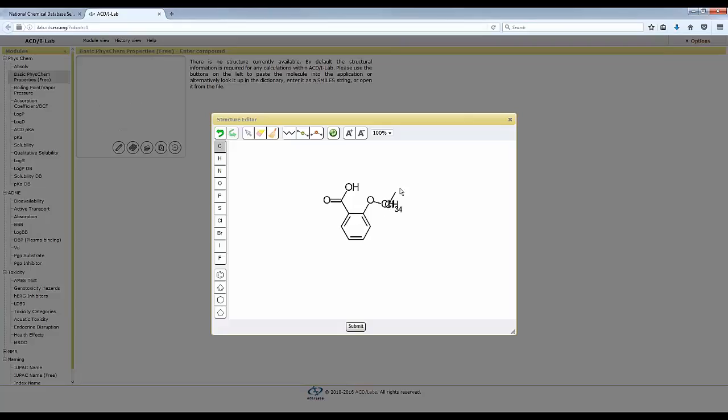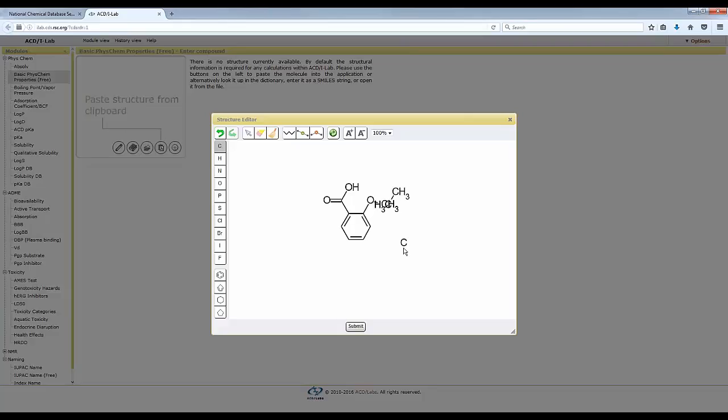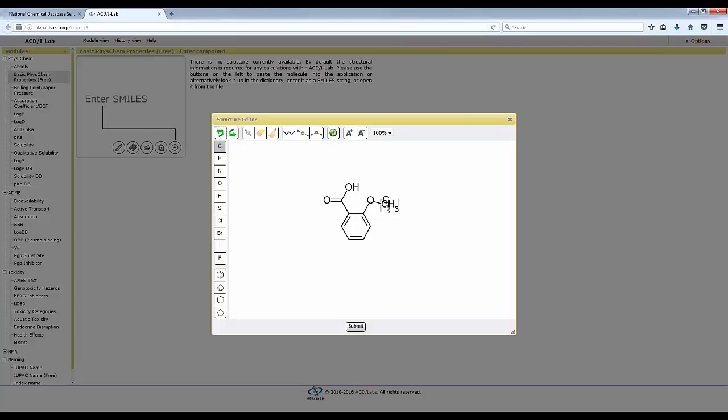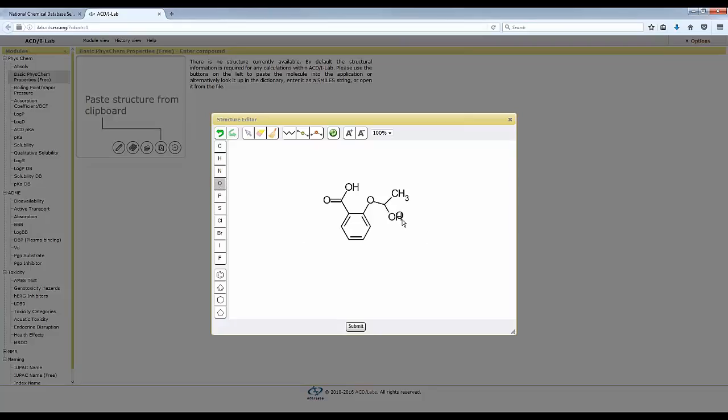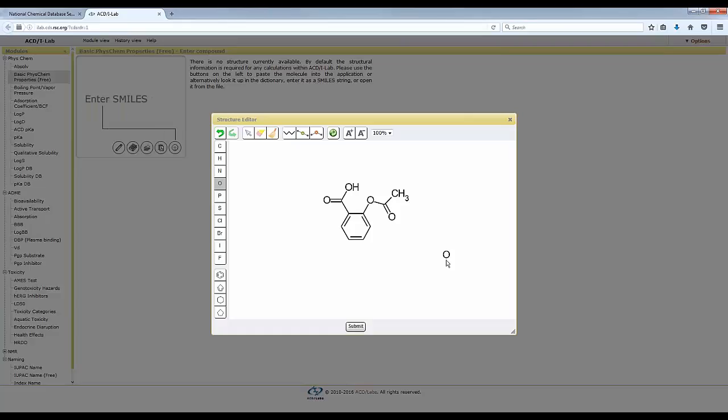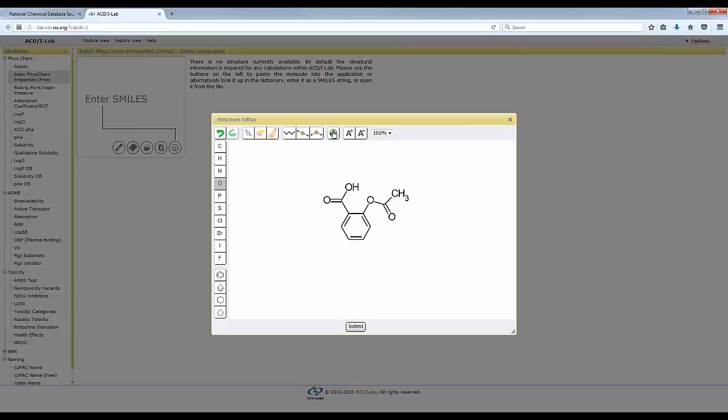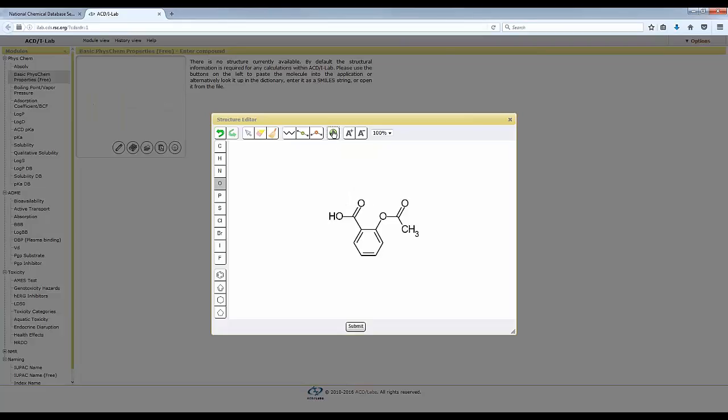If I want to make an oxygen or another atom, I can go here and click and drag, and this becomes an oxygen. If I want to convert a bond to a double bond, I go on the bond and click on it. And if I go here and click again, I made a very nice acid. And I can continue drawing things. I'm just trying to make something that makes a little bit of chemical sense.